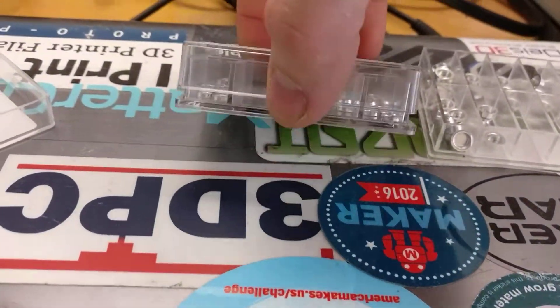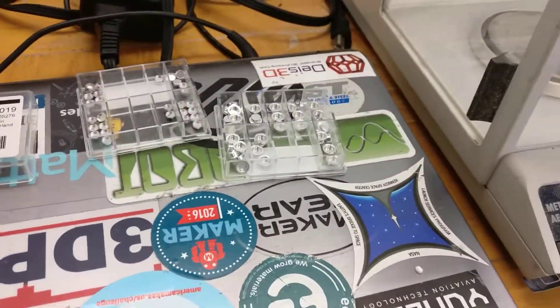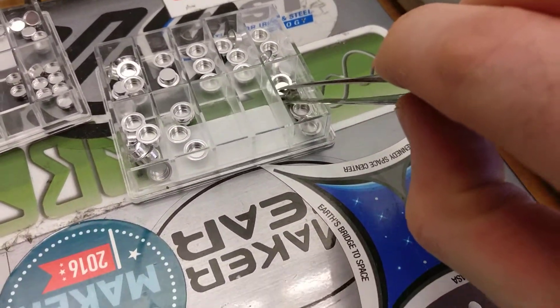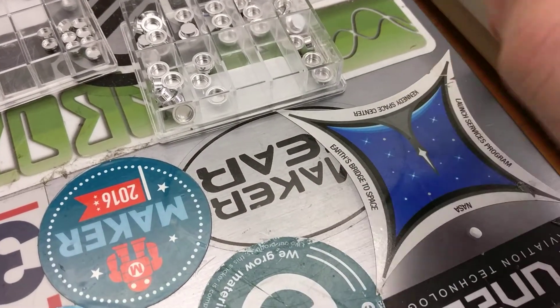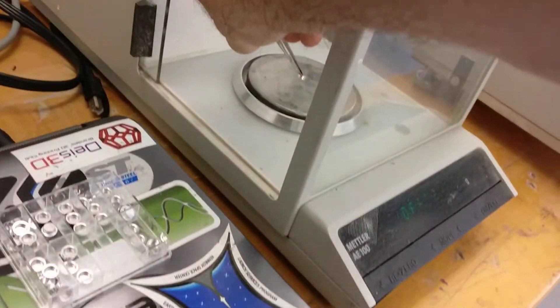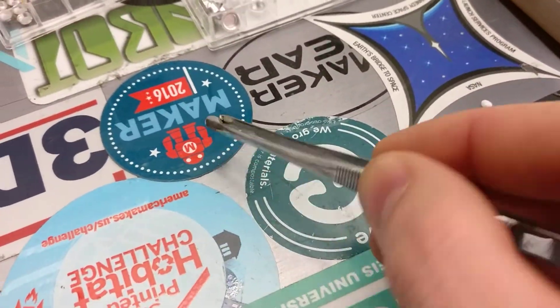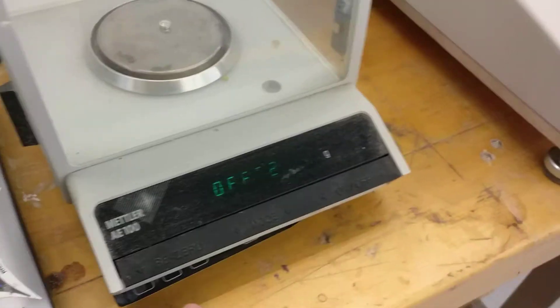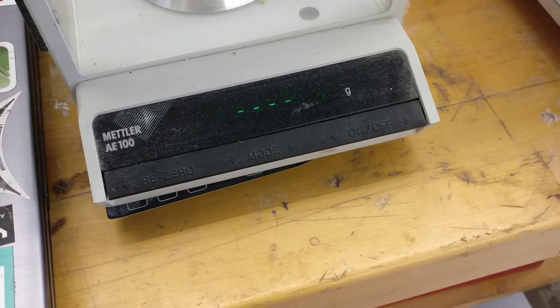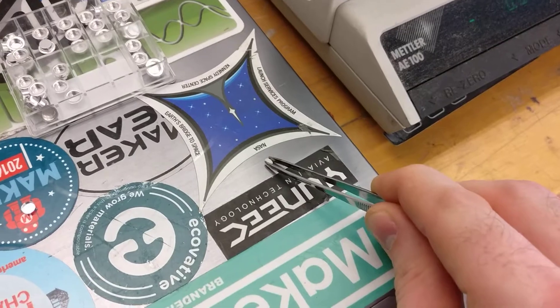For these containers, be careful — it looks like the lid would go the other way around, but the top is kind of big and comes off, otherwise you might spill them everywhere. Take one of these pans and open the balance door. They're made of aluminum, so be fairly gentle so you don't bend them. Take a pan and a lid, then hit re-zero and the scale will read zero.